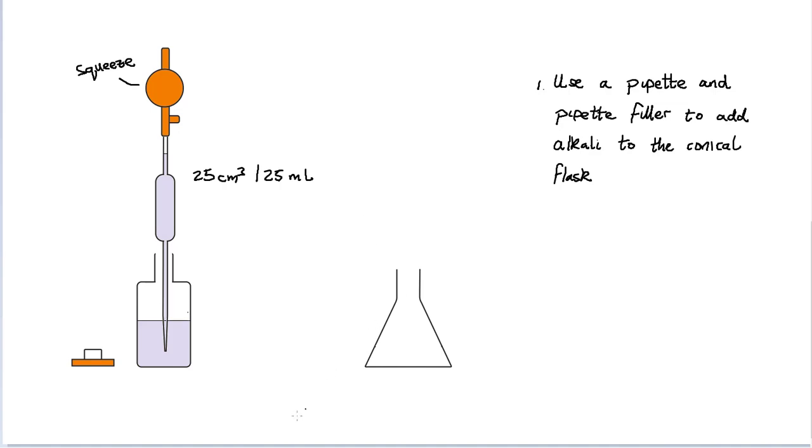We're now going to transfer that to the conical flask. By squeezing on the valve here I allow air into the system and the alkali then passes through the pipette into the conical flask. We've added the alkali to the conical flask. What we're going to do now is move this over to the burette, but before we do that we're going to add some indicator to the alkali.